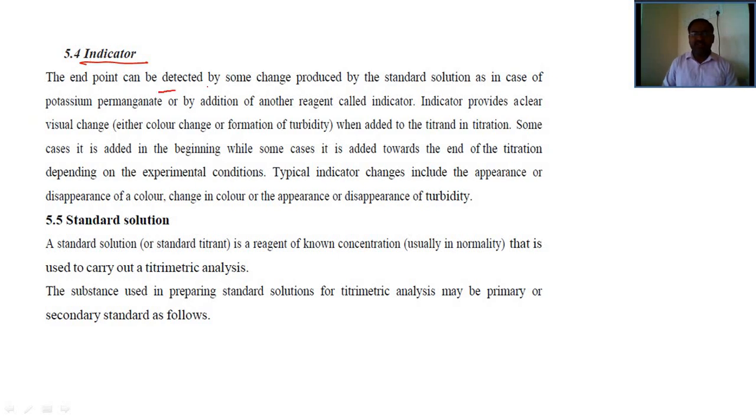Here the end point can be detected by some change produced by the standard solution, as in the case of potassium permanganate, or by addition of another reagent called an indicator. Potassium permanganate is purple in color, hence it also acts as an indicator. An indicator provides a clear visual change when added to the titrand in titrations.